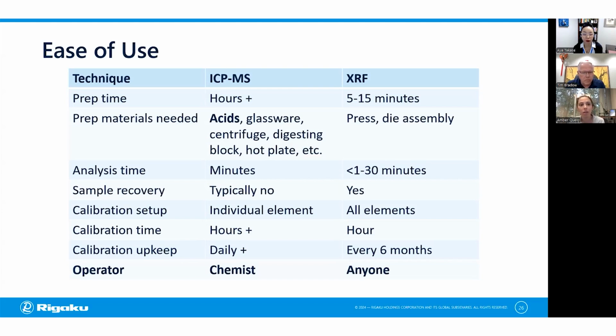As long as somebody can come in and tell the instrument where the sample is, what position, and what method it needs to run, anyone can walk up and use the system. So it's nice that you've got more than one department, hopefully at that point, that can come in and operate the instrument, and you don't have to have a dedicated operator or calibrator.